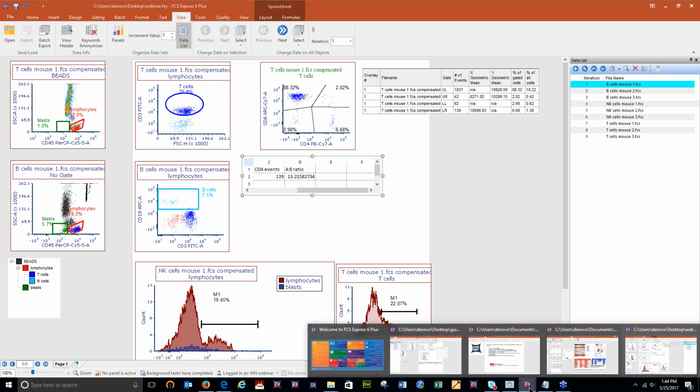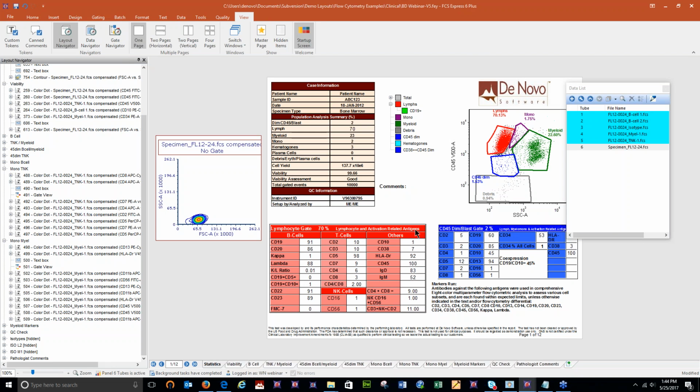But the custom text tables are nice because you can add all sorts of formatting elements and make your report look very professional. And that's useful if you're going to be making a template that you're using over and over and over again. Even if it's for internal use, why not make it look nice? Why not highlight the columns and just make it more readable?